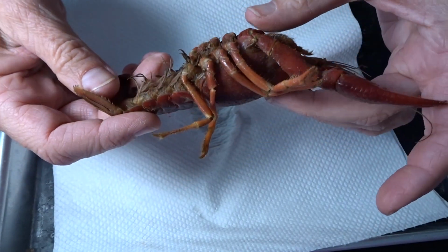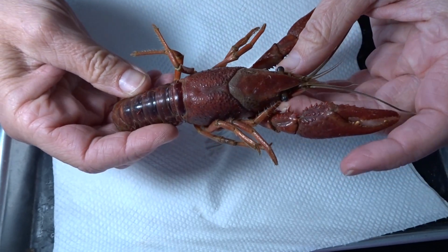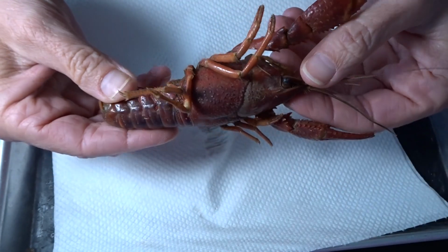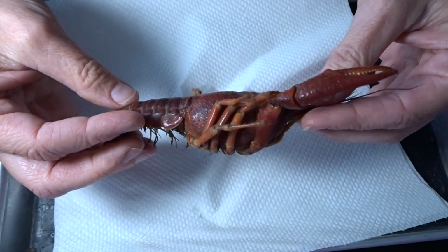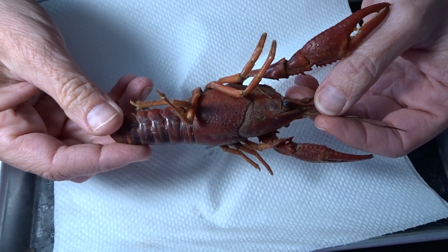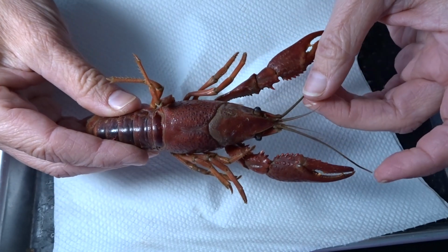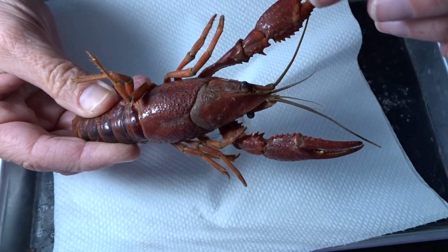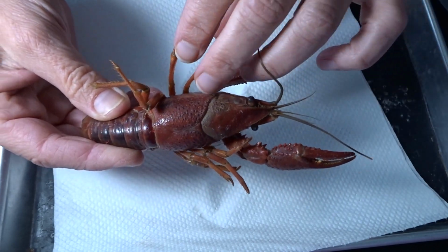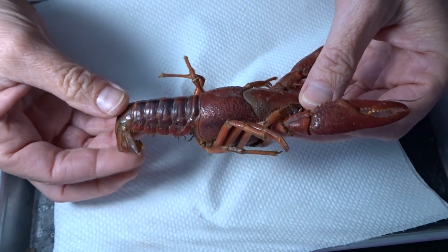This exhibits metamerism, right? The body segmentation. And there are actually 19 body segments in the crayfish, but you can't see them. They've been fused into that tagmata, right? Those different specific body regions. How do I know there are 19 different segments? Because there is a pair of appendages for every body segment that there is. So that's kind of cool.